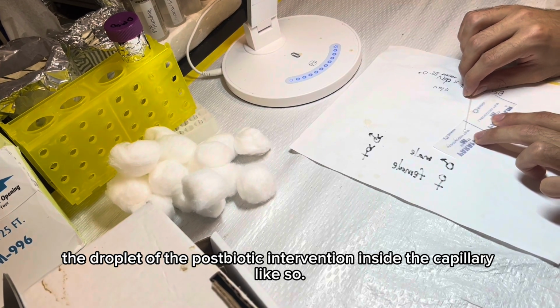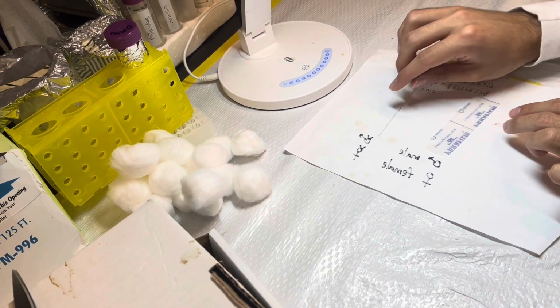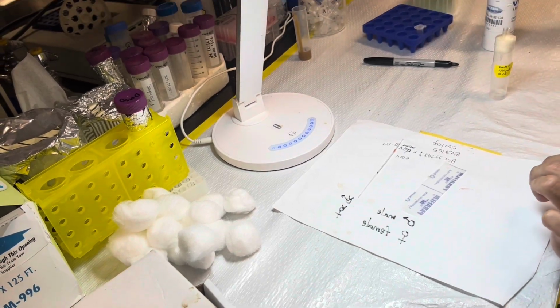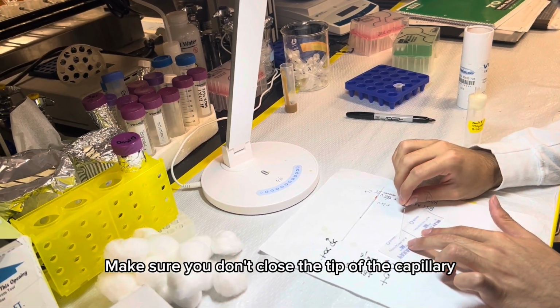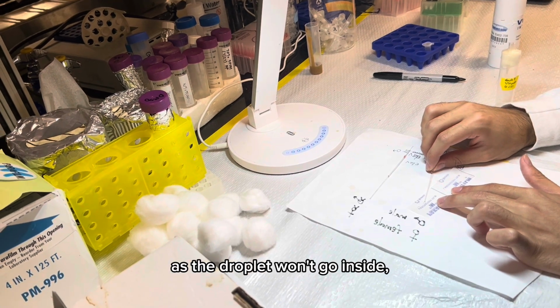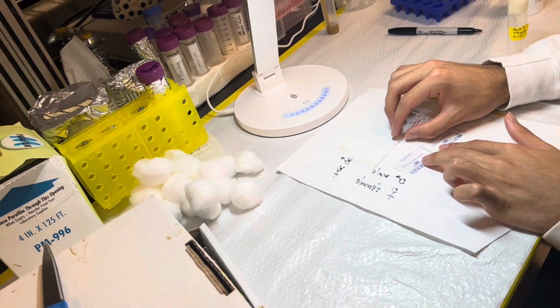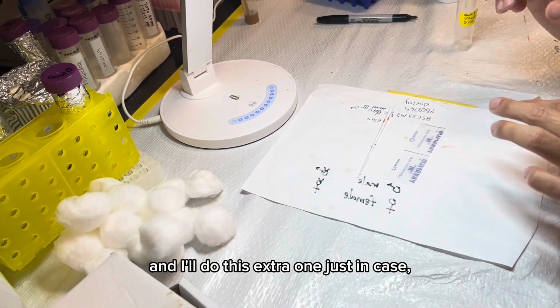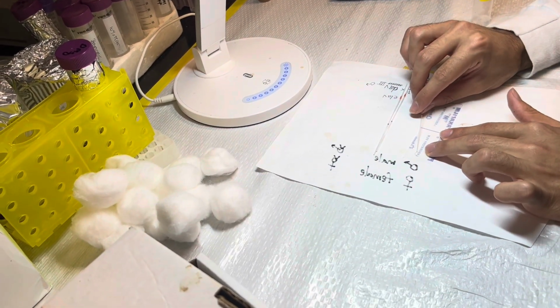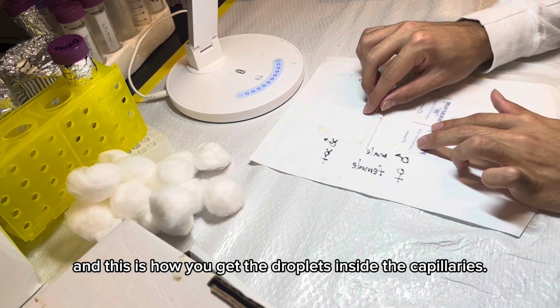droplet of the postbiotic intervention inside the capillary, like so. You make sure you don't close the tip of the capillary so the droplet won't go inside. And you just do that. And I'll do this extra one just in case. And this is how you get the droplets inside the capillaries.